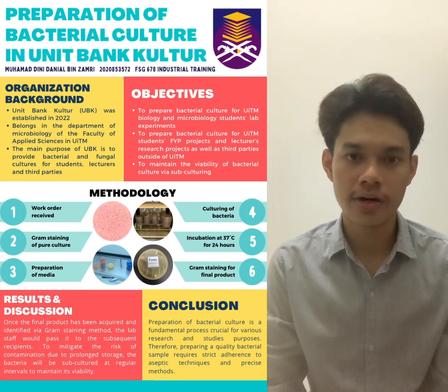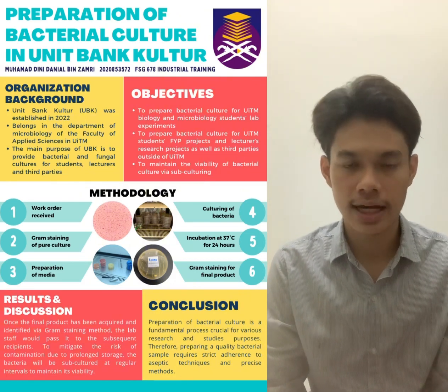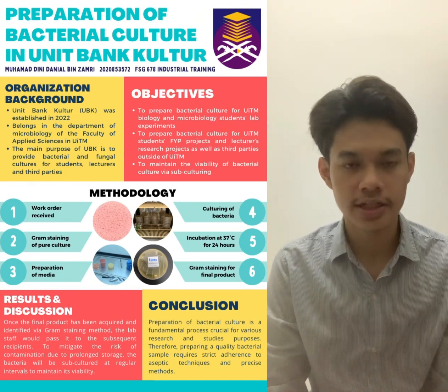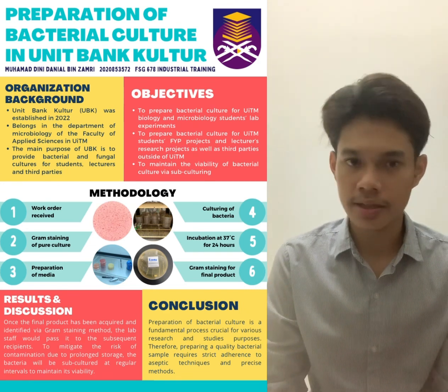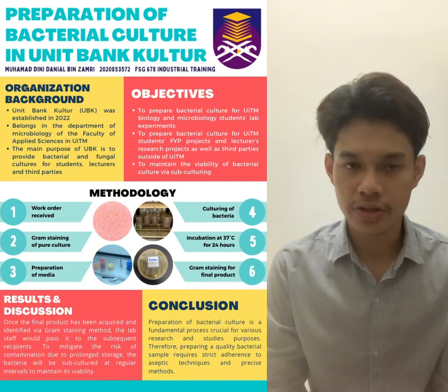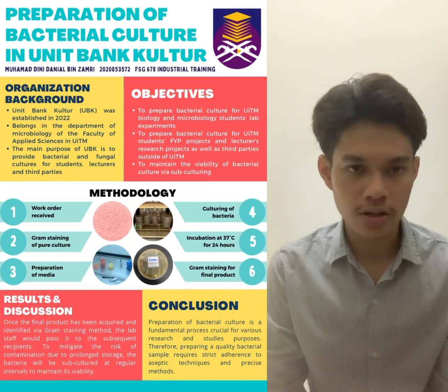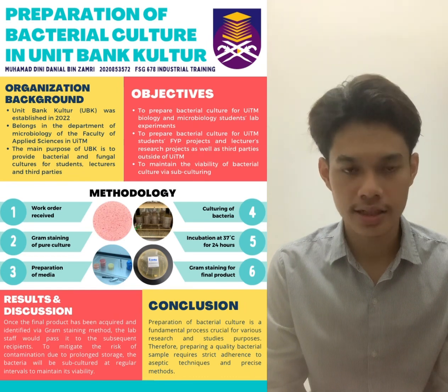Next, I prepare the required media such as nutrient broth, nutrient agar, or McConkey agar. After that, I begin the culturing process by streaking the bacteria onto the new plate using an inoculating loop. The streaking method may be either simple streaking in a zigzag motion to ensure uniform dispersion, or the 4-quadrant method to ensure single colonies. During the whole process, I make sure that I strictly adhere to the aseptic techniques.